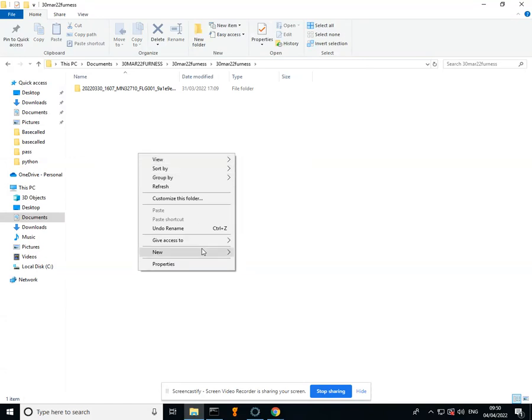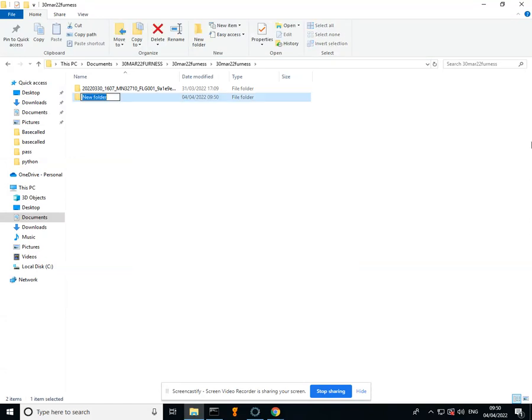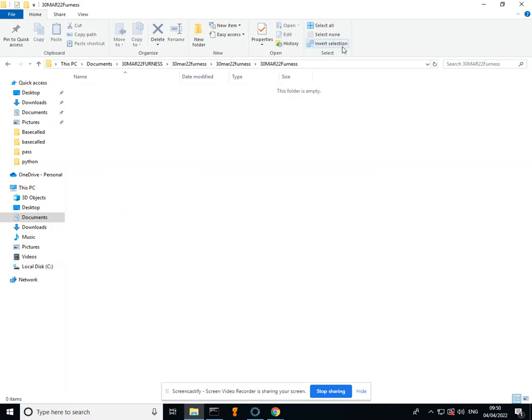...and add in a new folder. I've gone down the whole thing of picking out the day plus the actual cultivar.